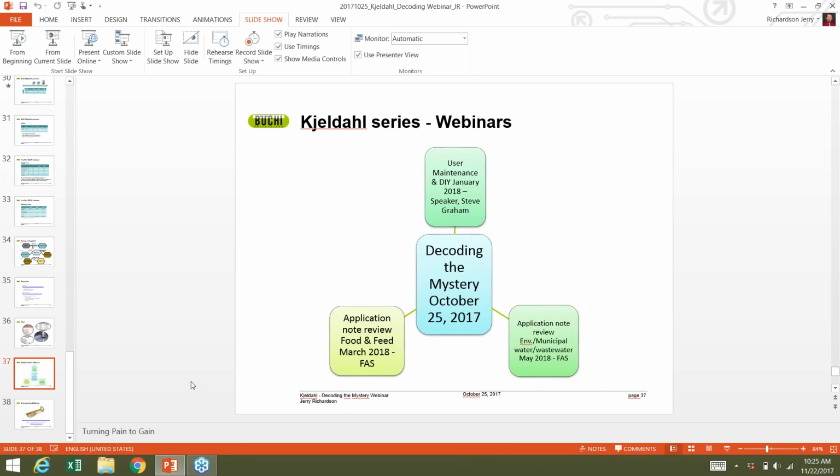I do want to run just real quickly a reminder that this webinar is the first in a series. We talk initially about the chemistry. We'll move on to the maintenance and the health of your system, and then we'll talk about some application reviews. And especially when we're talking about the user maintenance, that will be chopped up into little pieces, so that it's easier for you to get what you're after. And we will have a video for those who want to do the do-it-yourself sort of thing.